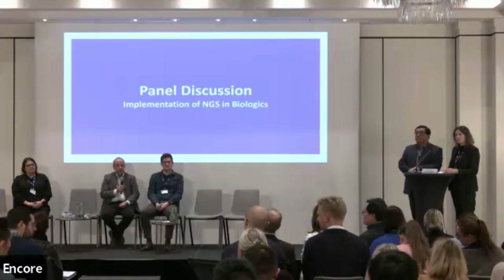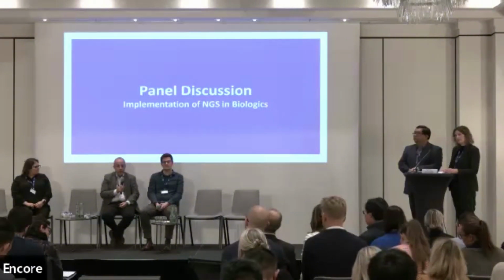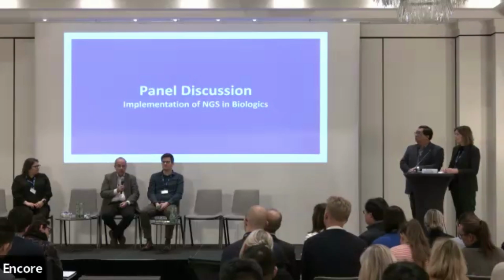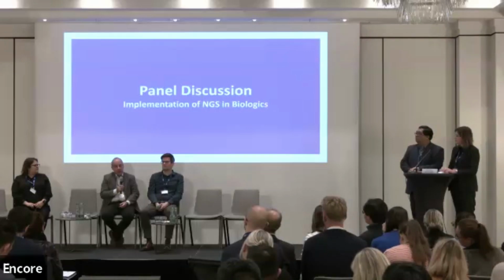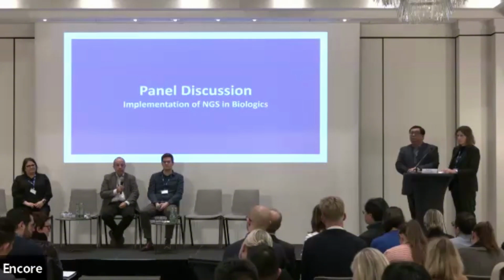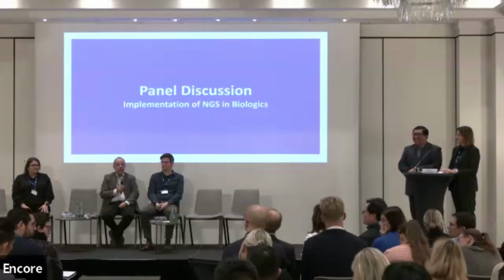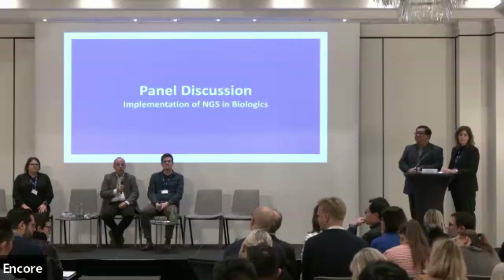Yeah, and what about sensitivity detection? It's comparable, so we haven't completed our validation, but all of our experiments so far, it's comparable sensitivity, except for things that we now detect that we couldn't, in which case it's much better. Without any numbers? I was just like, is it comparable to what we've seen? Is it 10 to the fourth in cell background of a million cells, or?